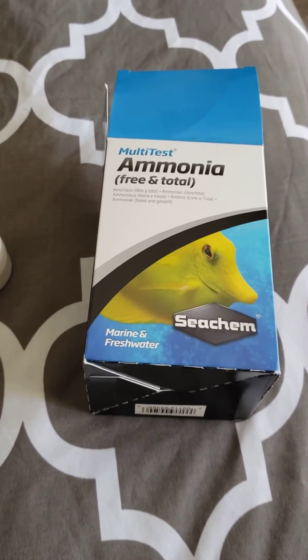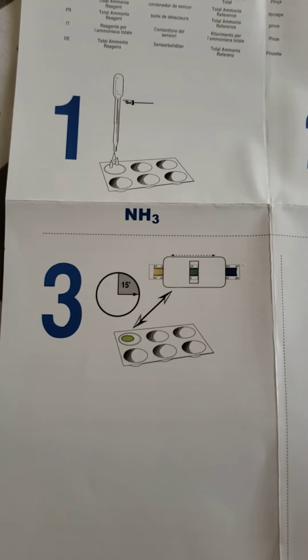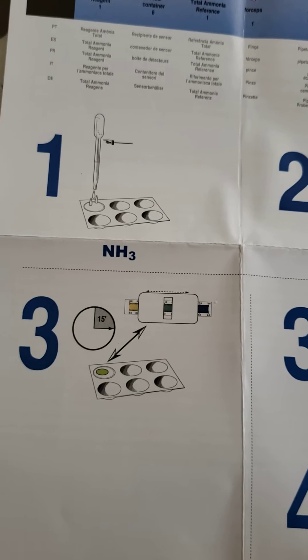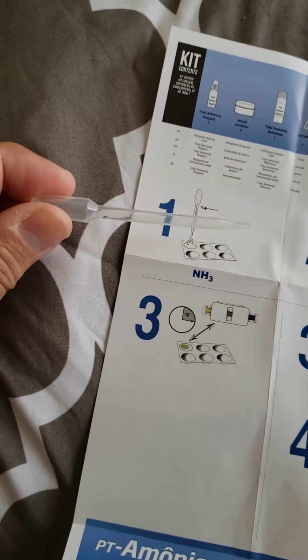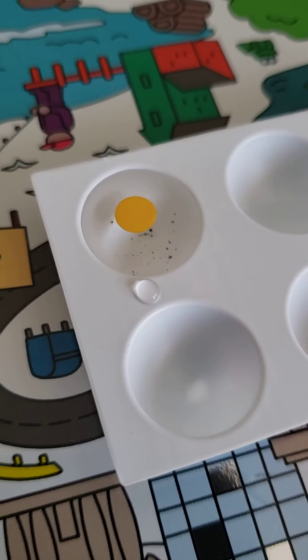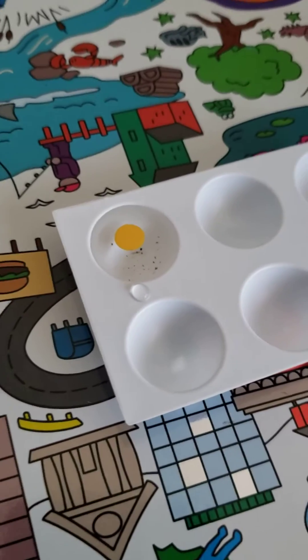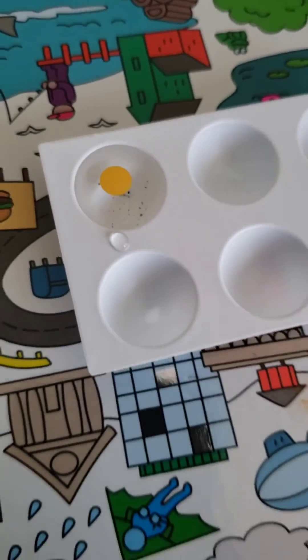Here we have the ammonia-free and total instructions. Fill up each cavity with the pipette — you need two of these. Suck up the water two times to fill it up. The black stuff is from some dust that was on top of the pipette. Those will change color.